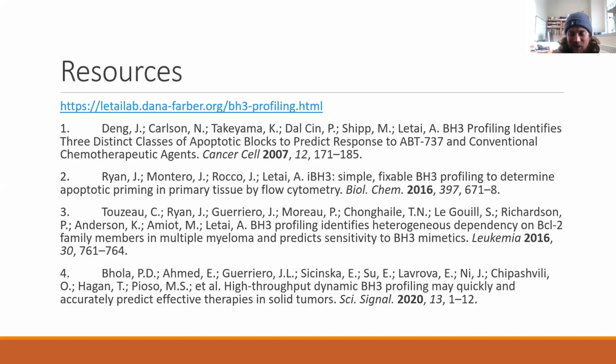No, that's fine. I haven't had any issues with digitonin in terms of permeabilizing my cells. But if you have a specific cell type that potentially has those contraindications or reactions, then there are other detergents you may want to look at. It's mostly about adapting the protocol to fit your needs, right?